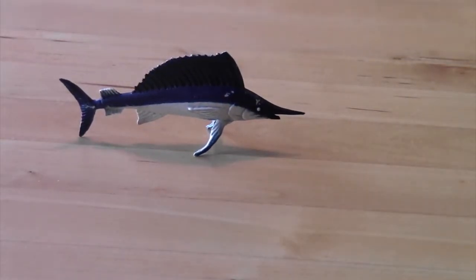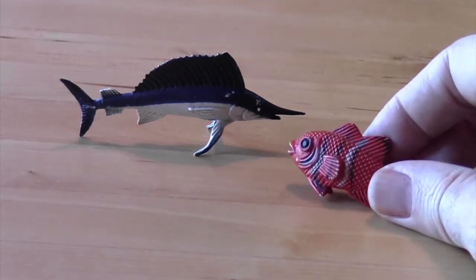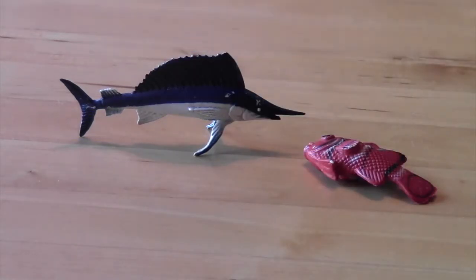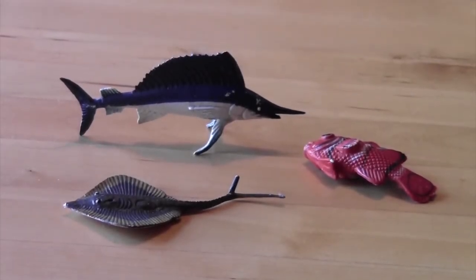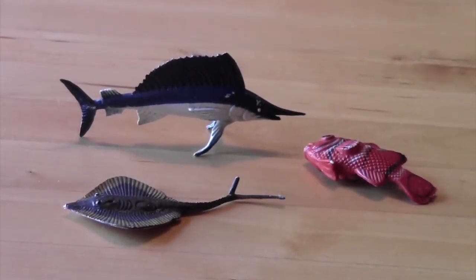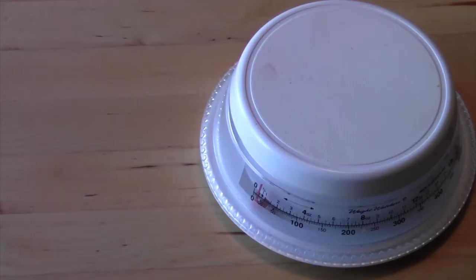Normally, if we were doing this lab on campus, we'd be using goldfish as our test subjects. But having no goldfish, we're going to have to make do with what we have. So we're going to use a sailfish, a clownfish, and a stingray. Now, of course, being three different species, we're going to have to take into account that they may have different metabolic rates, and therefore we might have to adjust for that, but hopefully they'll be similar enough that we can use the data. So step one, we need to weigh the fish, get their mass.